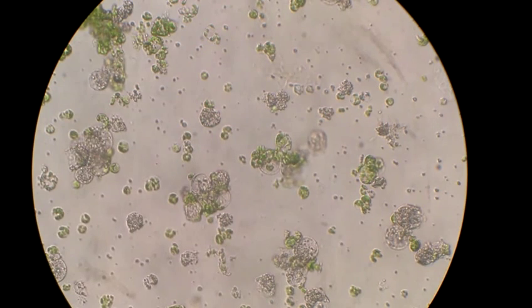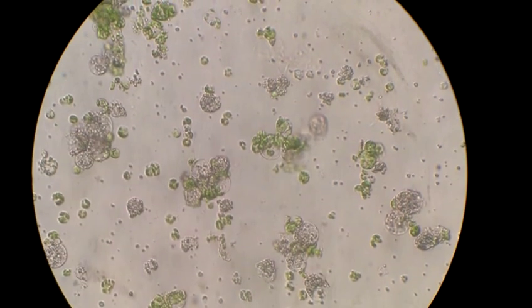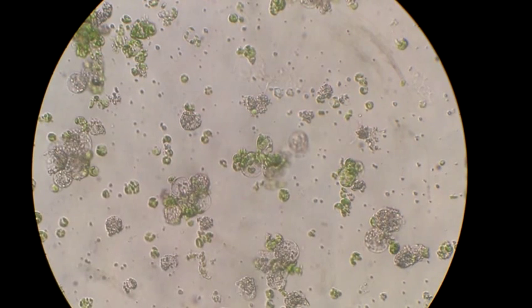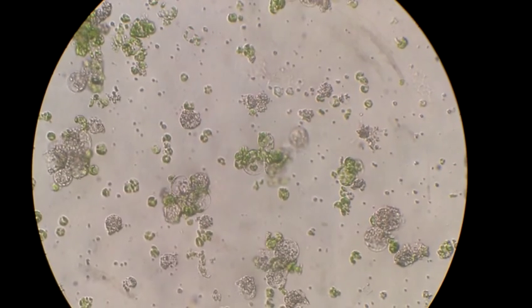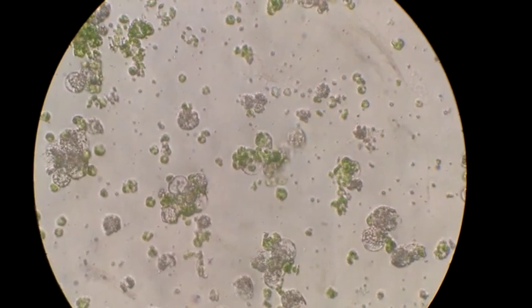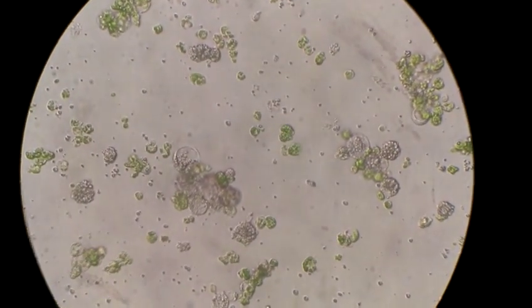And that's what they look like. And the green ones — so right there in the middle is a fusion. The clear ones come from the grapefruit, and they come from callus, so they don't have any chloroplasts — that's why they're clear. The green ones come from leaves; in this case, this is the pumelo parent. And they make small spheres.